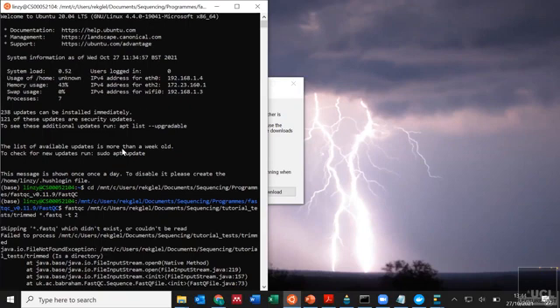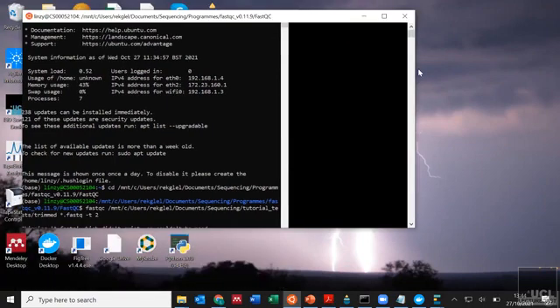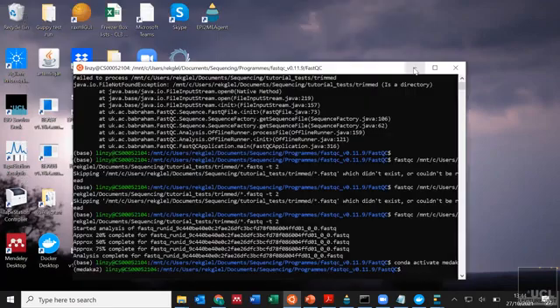So if you run the Windows subsystem, you can then run almost like a separate container that has Linux-based commands in. So I run it using Ubuntu. And it just means that I can run programs that I wouldn't otherwise, for instance Flye and Minimap2. I couldn't run this on a Windows computer if I didn't have the Windows subsystem.